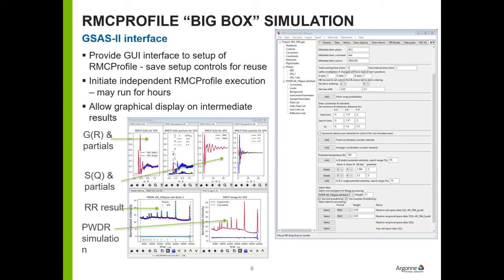You also fit the powder diffraction pattern itself directly from the model. In this particular case, you can see here, this is actually the Rietveld refinement, but this is also the fit from RMC Profile to that same data using this big box model. And this is what the interface looks like.